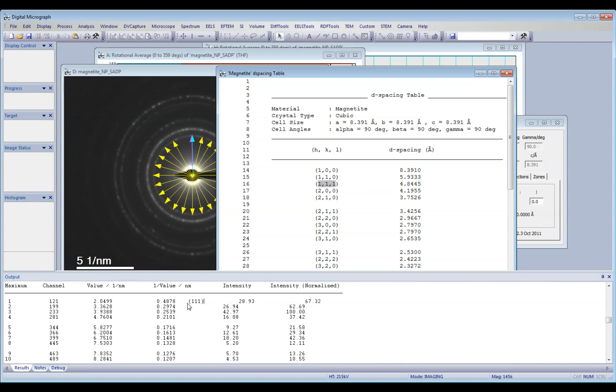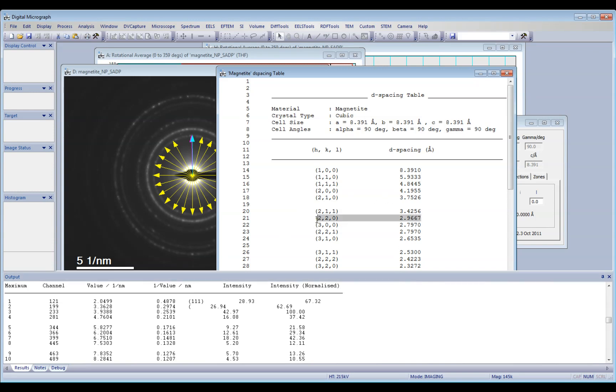So here I measured 0.297, that is actually here, the 2, 2, 0 plane.